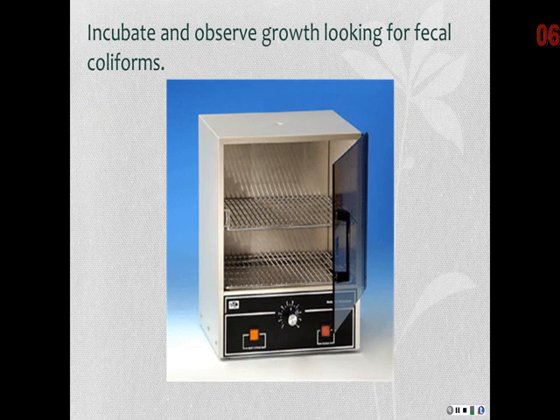And then we incubate it. And this is exactly the type of incubator we have in the back room. And we will incubate those at 37 degrees, which is body temperature, which is what fecal coliforms prefer to grow at. Being that they are in water, they can be grown at a slightly lower temperature, and they will still grow. It just takes a little bit more time. Usually we're trying to speed the process along a little bit, and 37 degrees is going to be the fastest temperature for growing them.